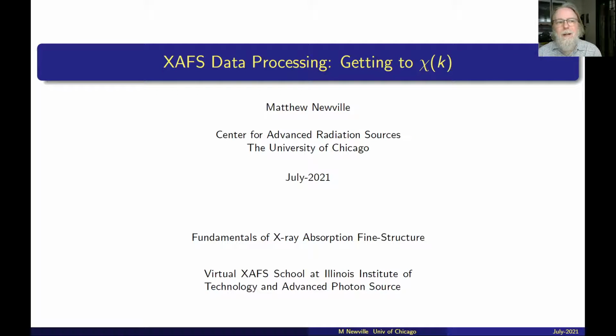In this video, I'll go over some of the data processing steps for XAFS. Again, these include normalizing the XAFS spectrum, which is used for all XANES analysis, and for the extended XAFS, it also includes the background subtraction to isolate chi of k. Fourier transforms are also vitally important for understanding XAFS, and so we'll also go over many of the features of Fourier transforms for XAFS analysis.